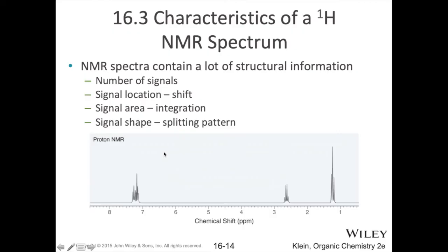Finally, we have the splitting pattern. Splitting patterns are really useful because they tell you a lot about the environment the atom giving that signal is in. Based on the atoms neighboring that atom, your signal will be split up accordingly.